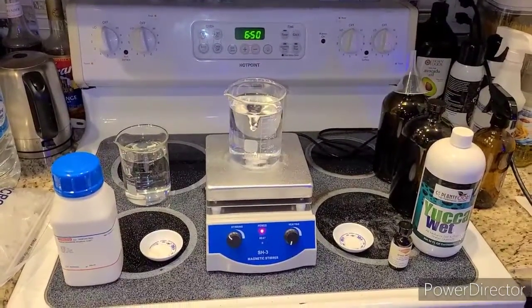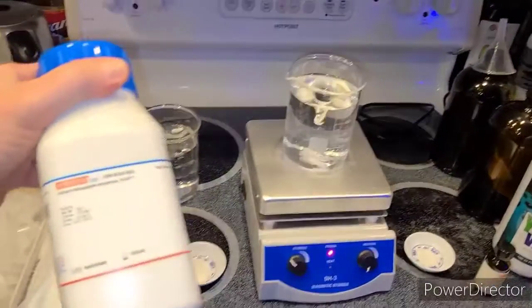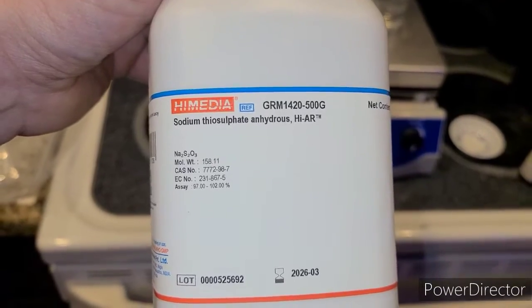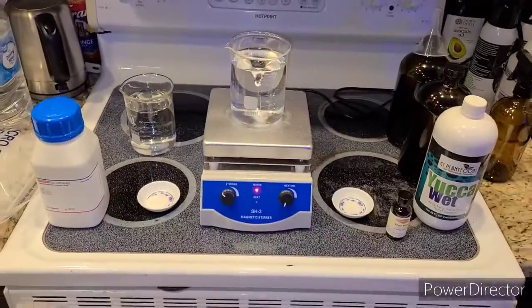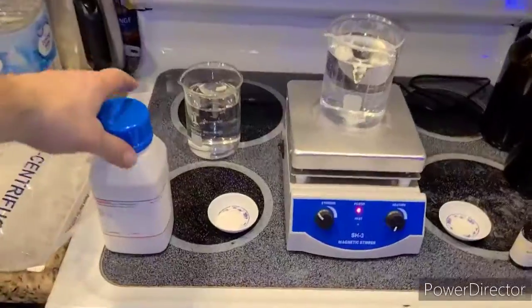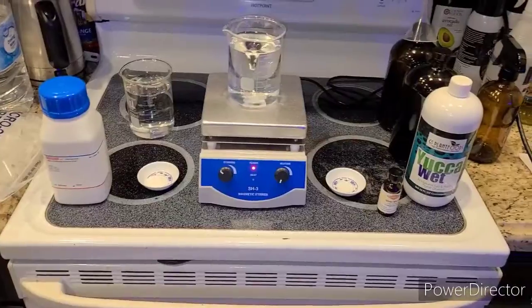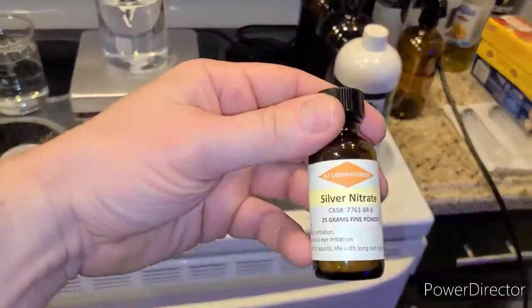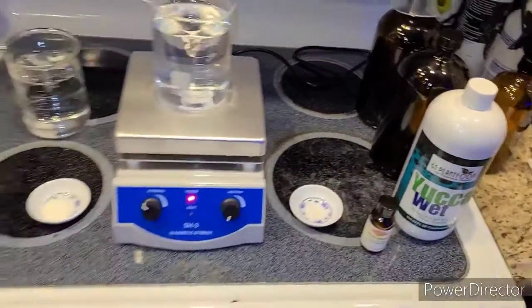Basically you're just mixing up some compounds, and these are all the materials you need right now: sodium thiosulfate — either anhydrous, which is what I got, or pentahydrate. The pentahydrate requires a slightly higher amount in the ratios, but both work fine. And you also need silver nitrate.